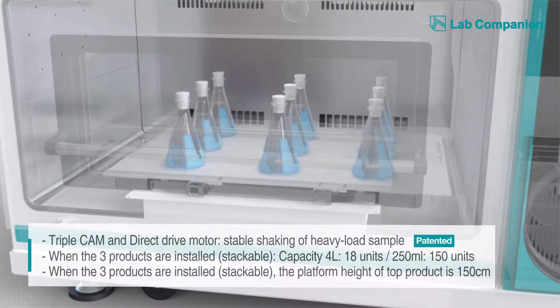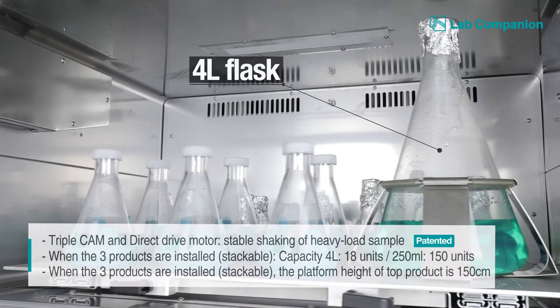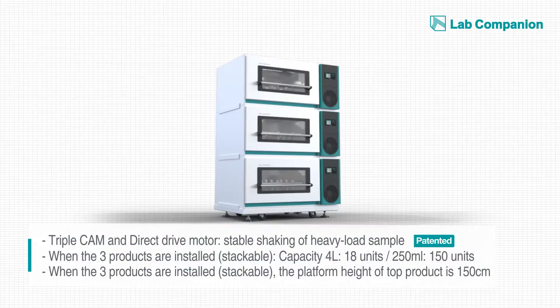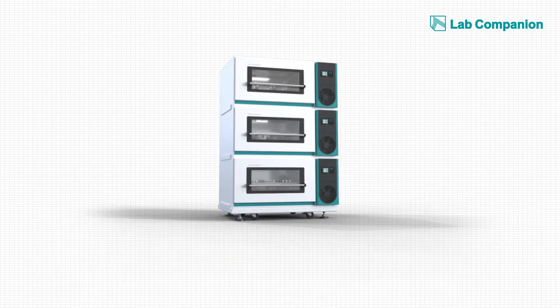In addition, the clever design provides platform height flexibility, allowing the most efficient use of incubation space. When stacking three levels, it can load up to 18 4L Erlenmeyer flasks, but still the total height would be just under 150 centimeters, allowing easy physical accessibility to samples.